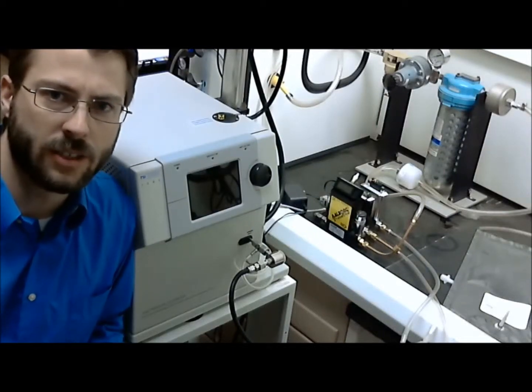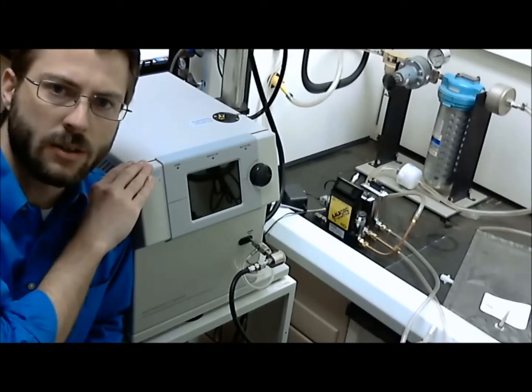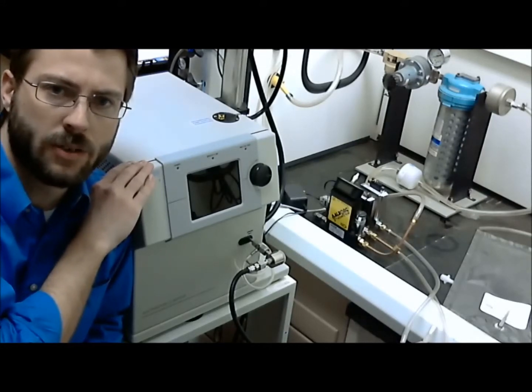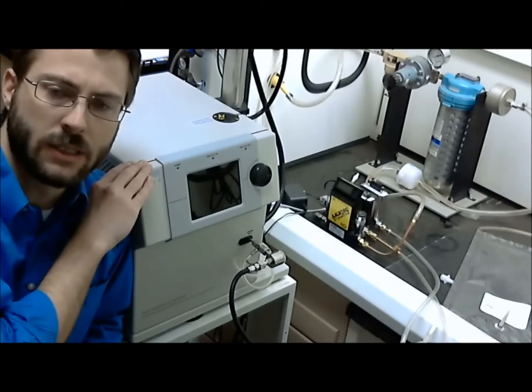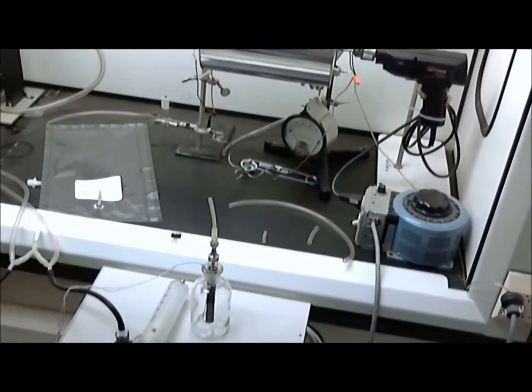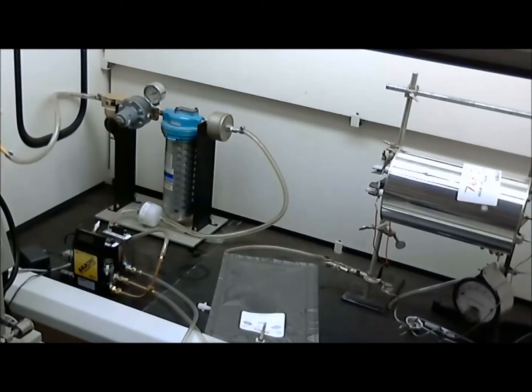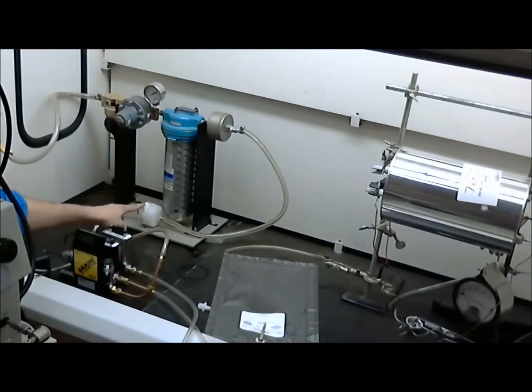To measure the aerosol size distribution, a scanning mobility particle spectrometer was used for the nano-sized aerosols, configured such that it could measure from 16 to 560 nanometers. An aerodynamic particle sizer was also used, configured such that it would measure from 500 to 20,000 nanometers, or 0.5 to 20 microns. These instruments were supplied with laboratory air that was dehumidified and filtered.